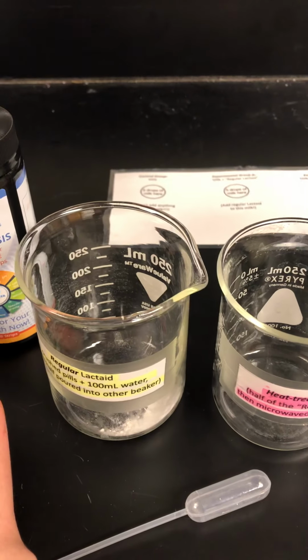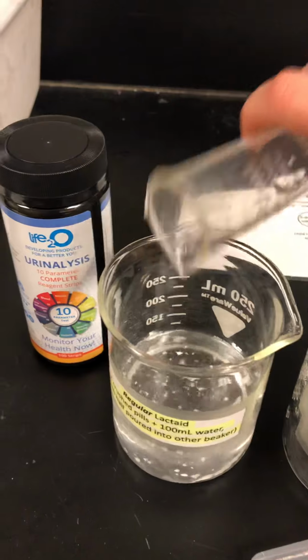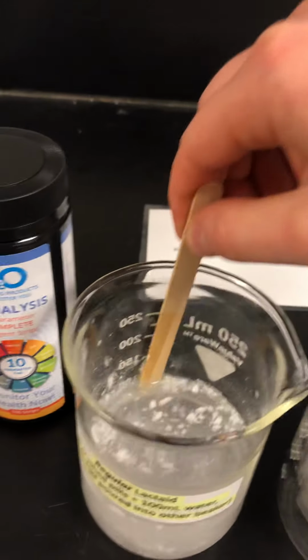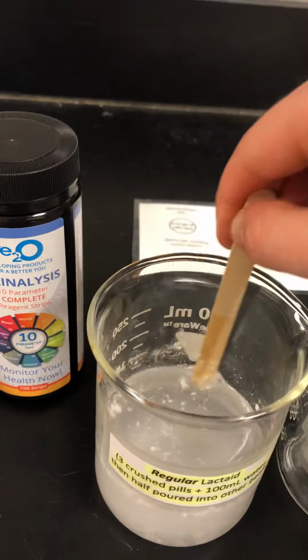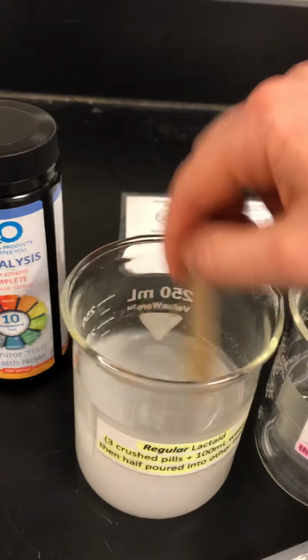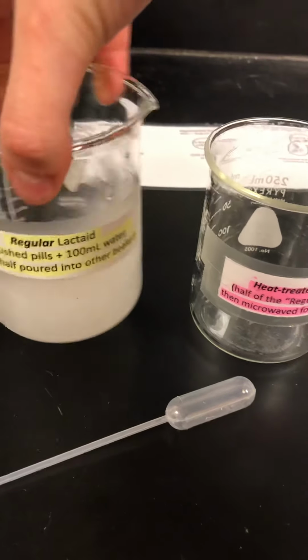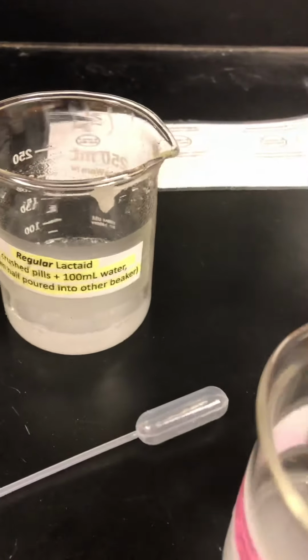Next, what we're going to do is add 100 milliliters of water to our pills, and mix it up best we can. If you've got some chunks in there like this, just try to separate them. And then we're going to pour half of it into a second beaker. Okay, so I'm taking my 100 milliliters of Lactaid, making sure it's pretty well suspended, and then I'm going to pour half of it into, I overdid it a little bit, half of it into my second beaker.